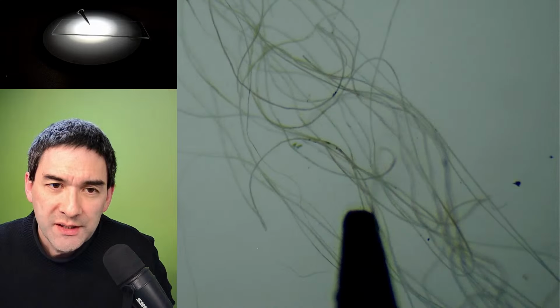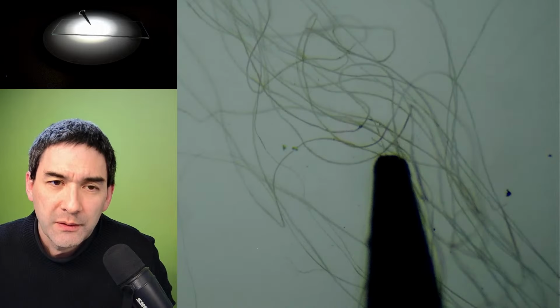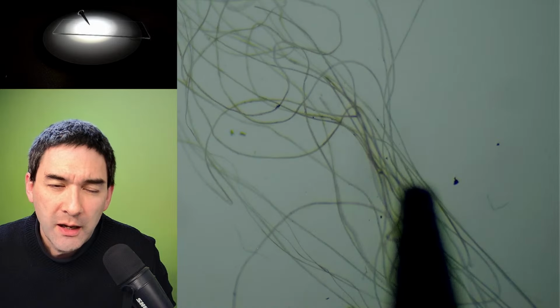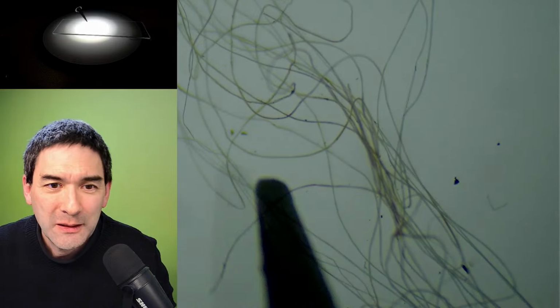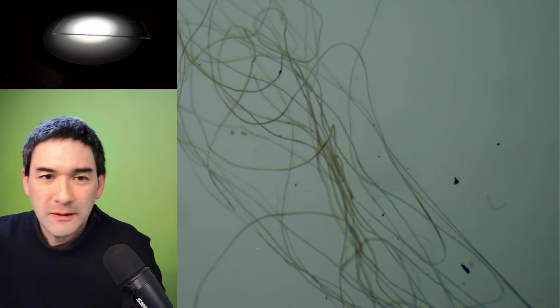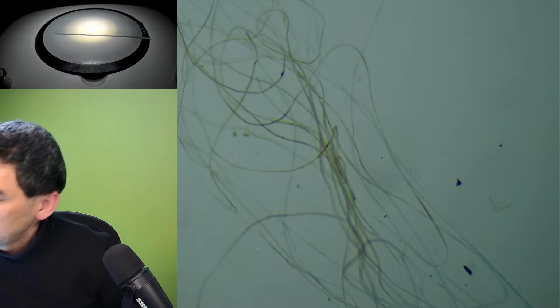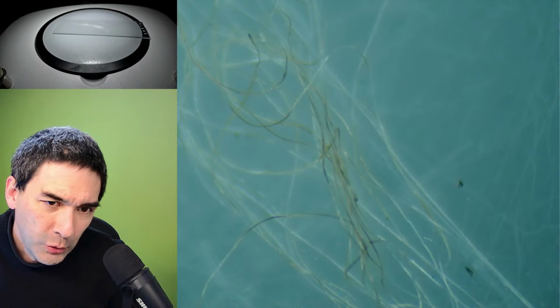For those of you just joined in, what I'm doing right now is this is under my stereo microscope. This is cotton, and I'm touching it now with a hot soldering iron, and therefore I always have to go off a little bit because I don't want the heat to go all the way to my microscope lamp. But you can see already that it starts to change color, obviously, right? Let me see what happens if I actually turn on the light from the top. Not a lot of difference. Oh yeah, maybe. So that's now top illumination, light from the top.